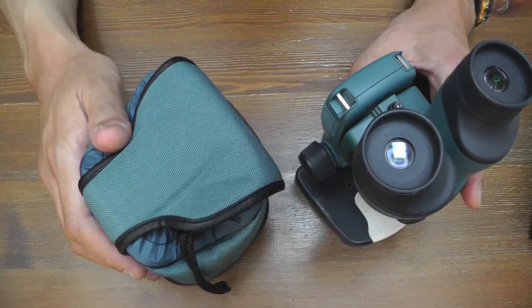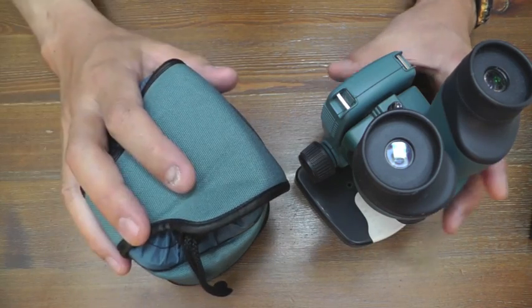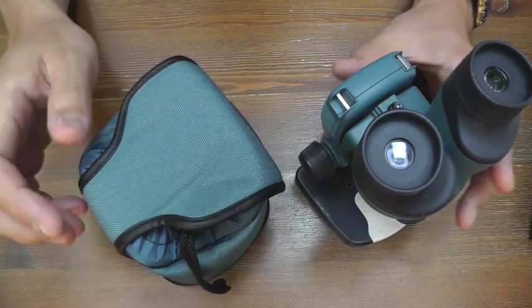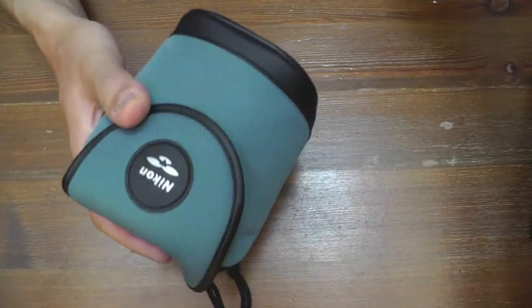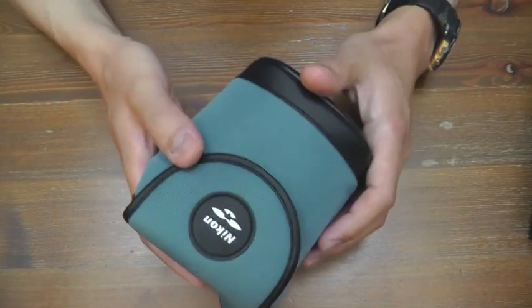Maybe 3, 4 years ago. It is still available. It's Nikon field microscope mini.